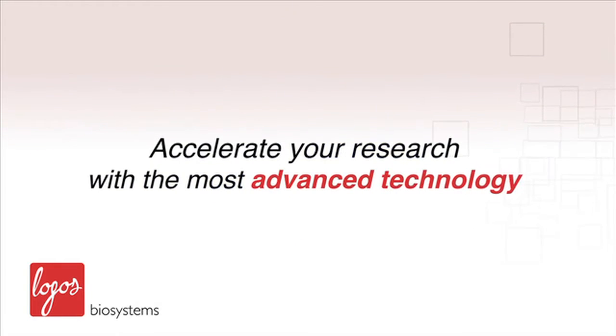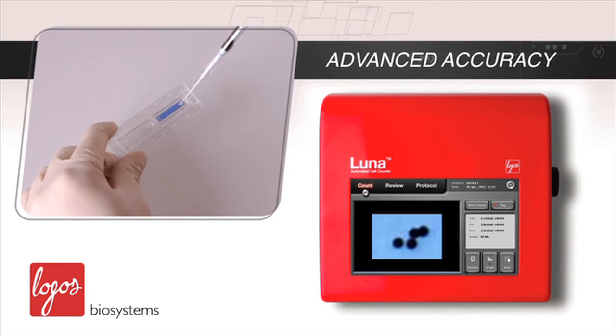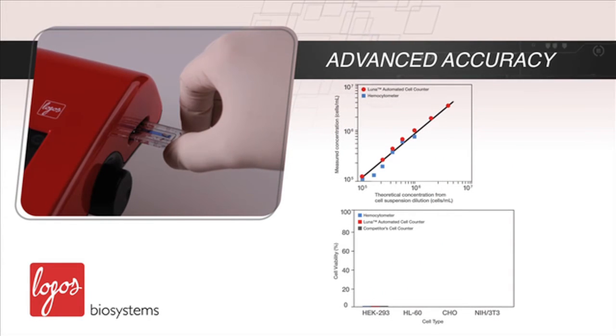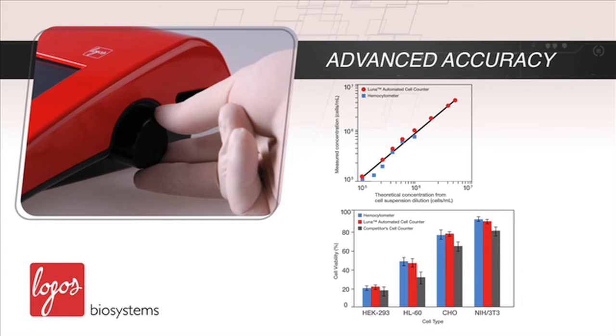Accelerate your research with the most advanced technology. Just how accurate is it? The LUNA gives you accurate live and dead cell counting results within just 7 seconds. Based on the precision optical design and the new software algorithm, cell counting accuracy is unsurpassed.